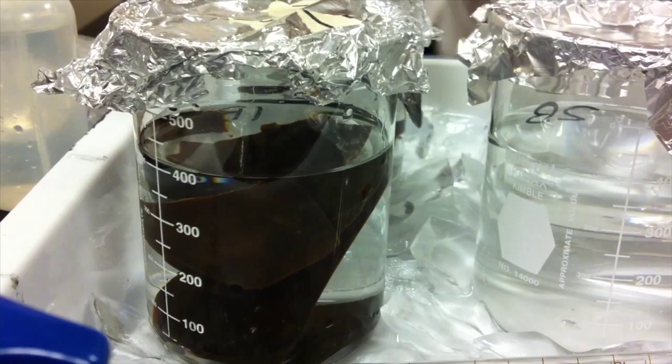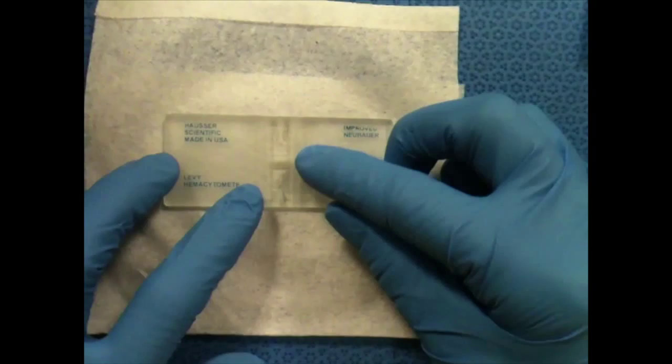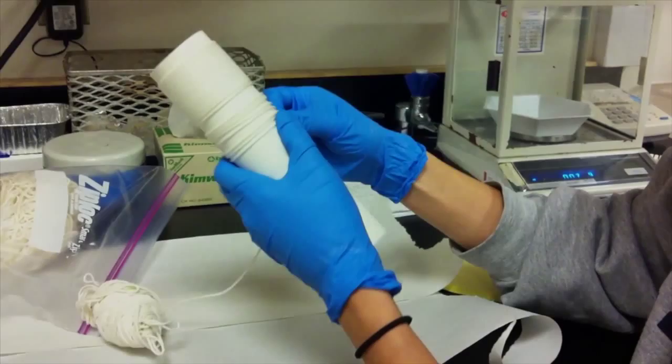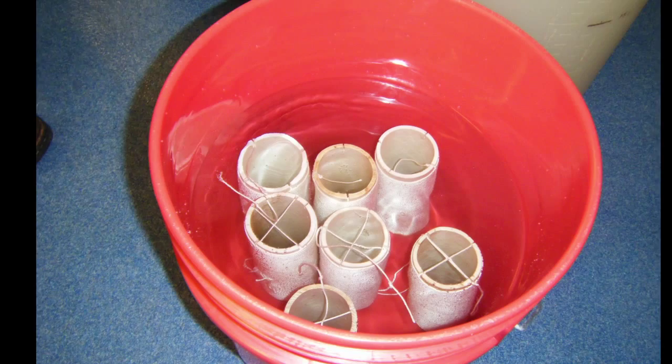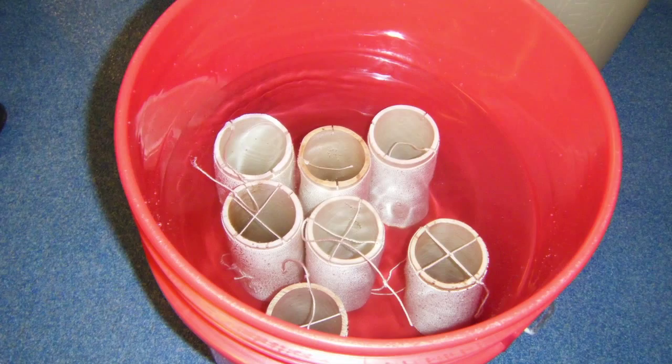A successful spore release will cloud the seawater. To determine the density of spores in the solution, a hemocytometer is loaded with a sample of the solution and spores are counted under a microscope. Spores are inoculated onto seed string, which is prepared by winding string around PVC tubes. These spools are placed in containers filled with sterilized seawater. After determining spore density, spools should be inoculated at about 3,000 to 5,000 spores per ml. The inoculation period is about 24 hours. During this time, spools are very gently aerated and held in 10 degrees Celsius seawater.